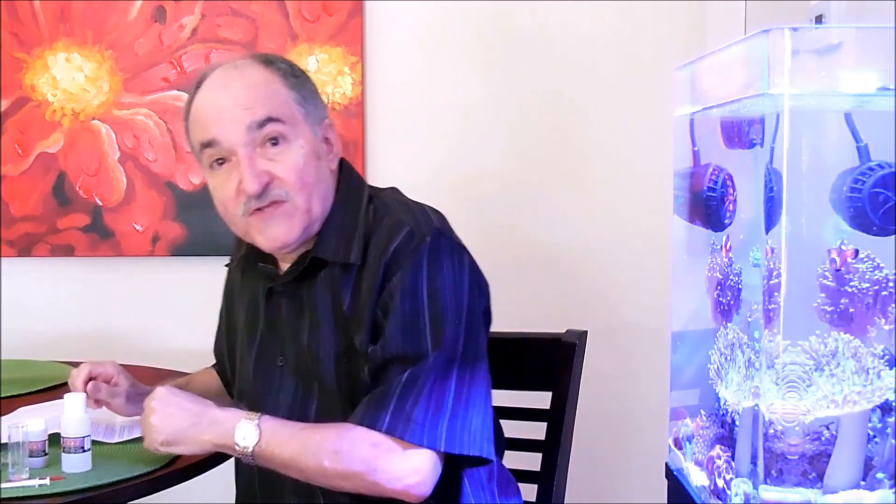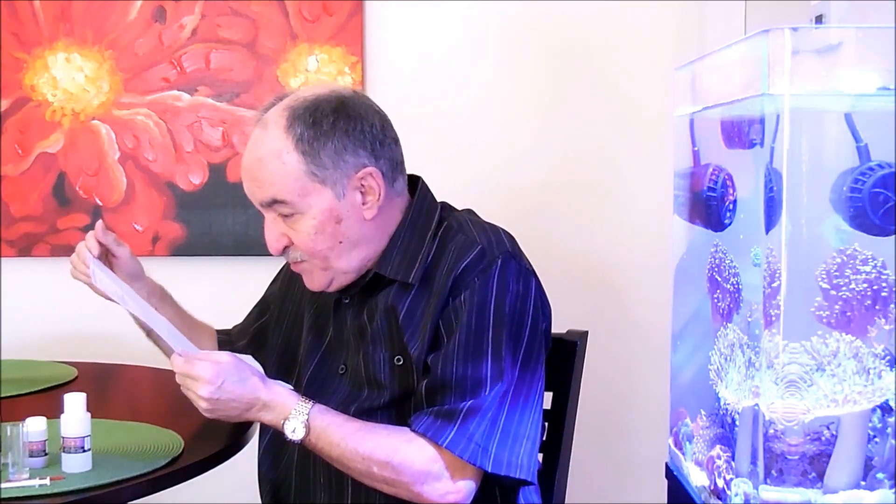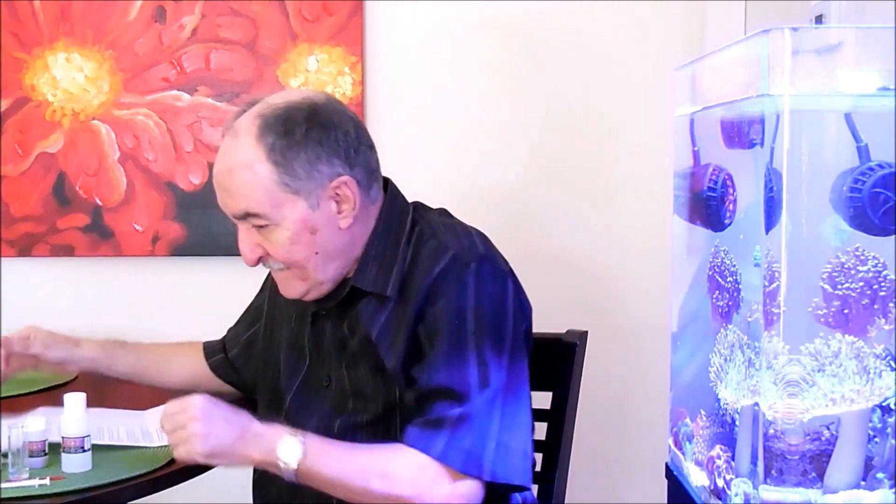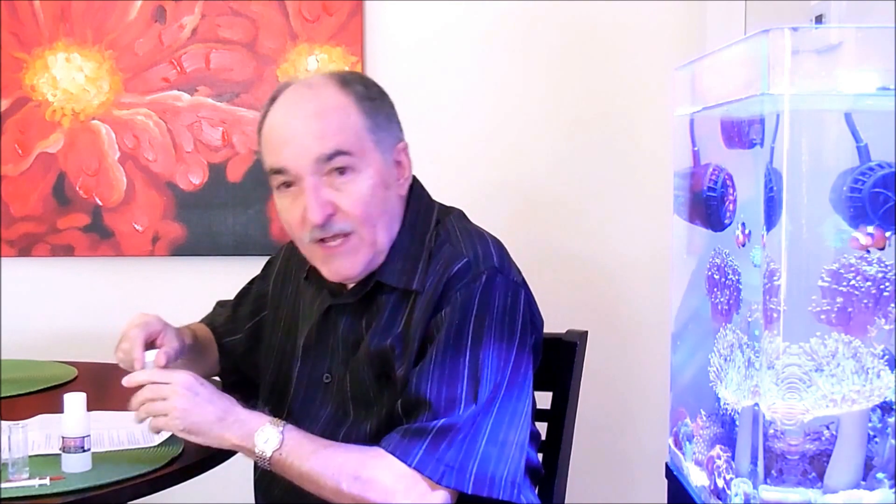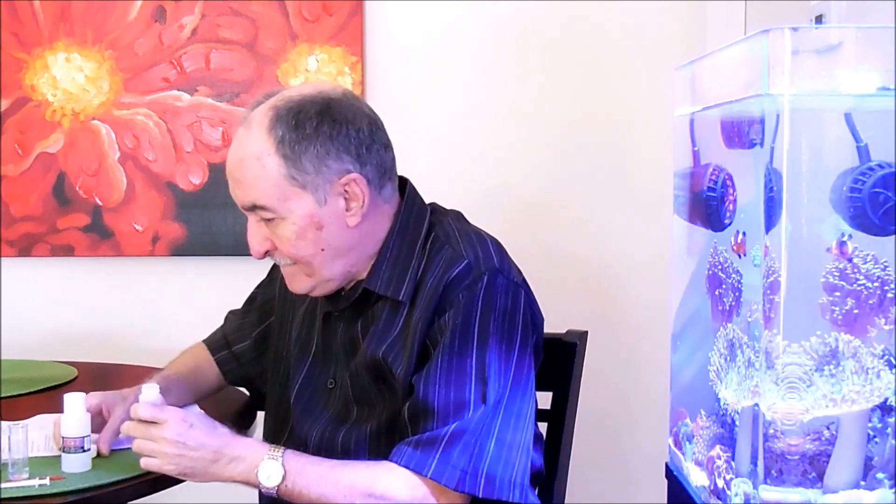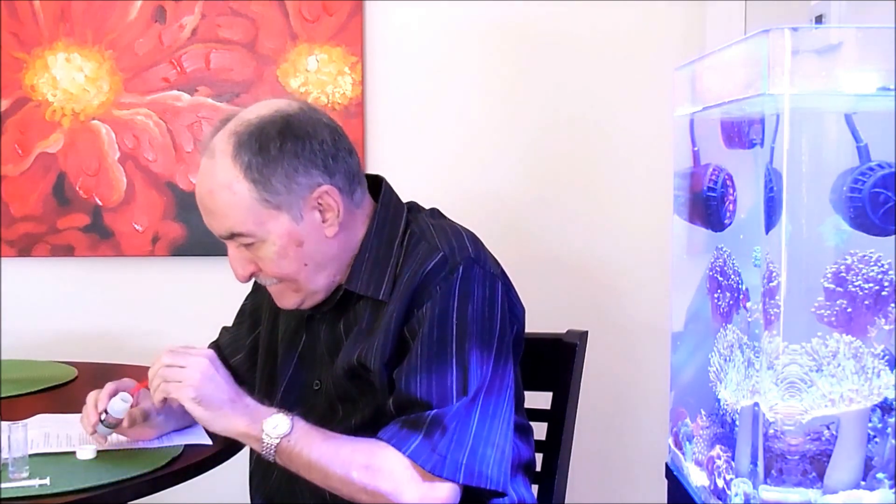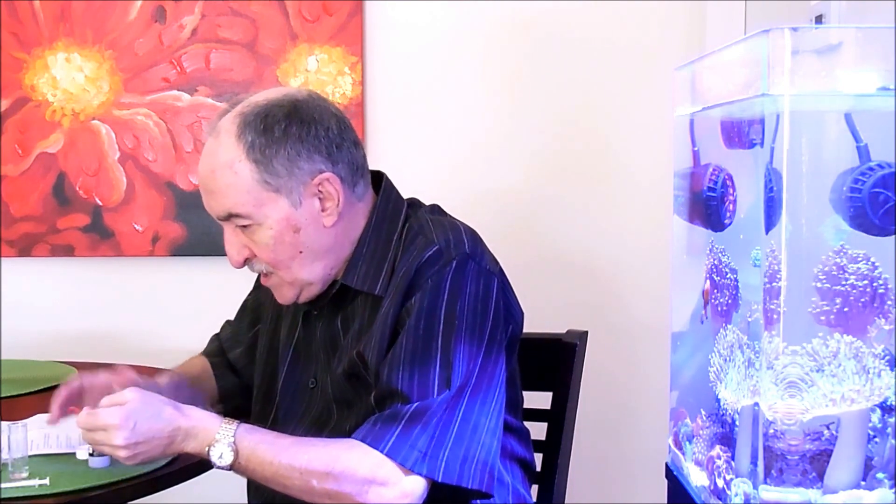Then the second step, it says to add 1 spoon of Cal 1. Cal 1 is this, so we're going to add 1 scoop. Let me put this over here. Here we are.